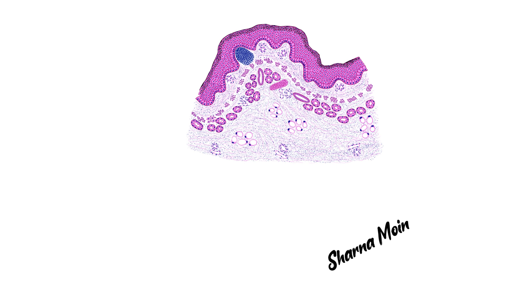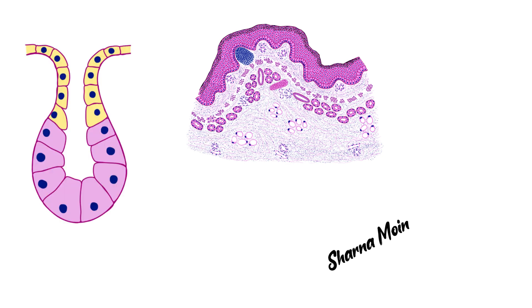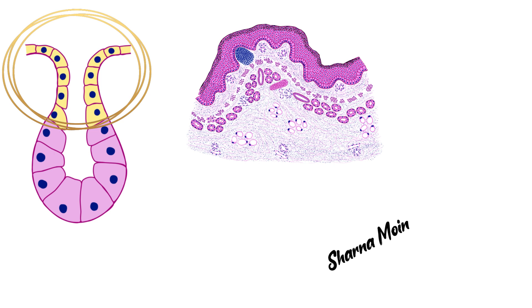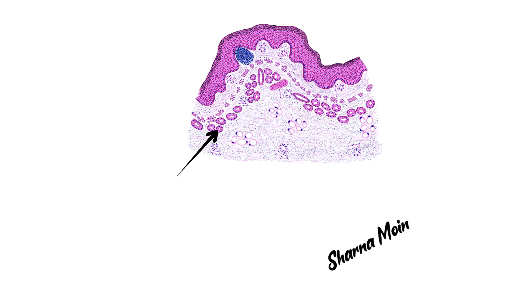The next layer below the mucosa is the submucosa. It is also a connective tissue layer, so it obviously contains connective tissue cells, connective tissue fibers, arterioles, venules, lymphatics, and nerves. It also contains glands known as the esophageal glands. These glands secrete mucus and have two portions: the secretory portion known as the mucous acini, and the excretory portion known as the excretory duct. The mucus secreted from these glands lubricates and protects the mucosa. You can also see a nerve plexus here — this is the submucosal plexus or Meissner's plexus — which controls the esophageal glands and blood flow in this region.